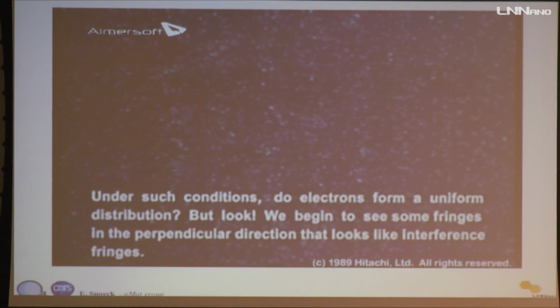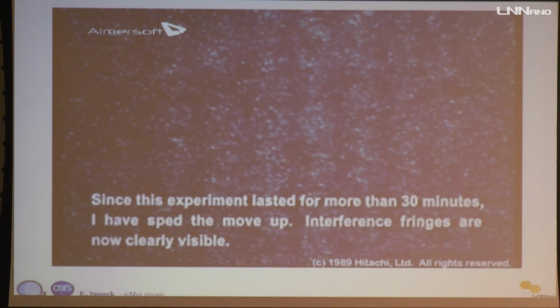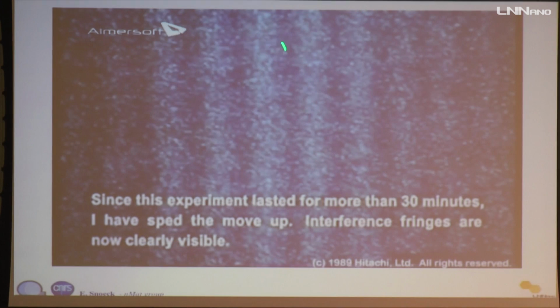And you imagine that you have a kind of homogeneous distribution. Well, the experiment has been done with a biprism. Okay, the experiment I described just before. So you have two beams coming on the detectors. And after 30 minutes, something like that, you start to see fringes.